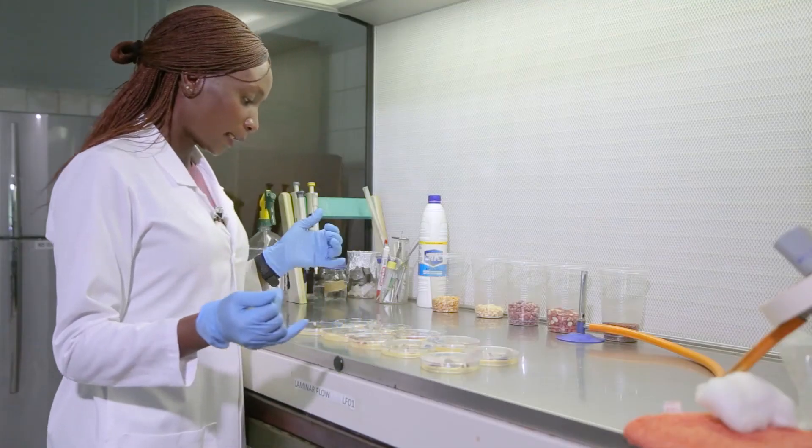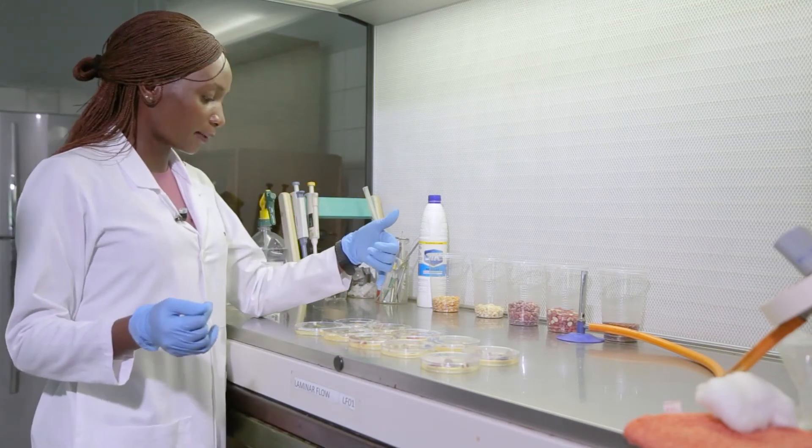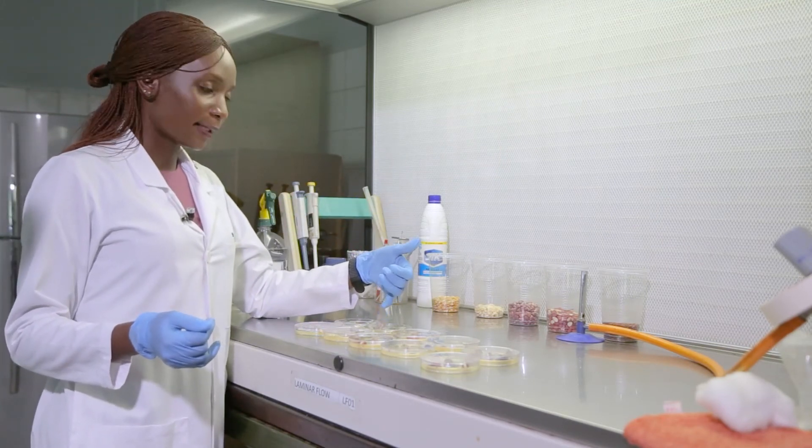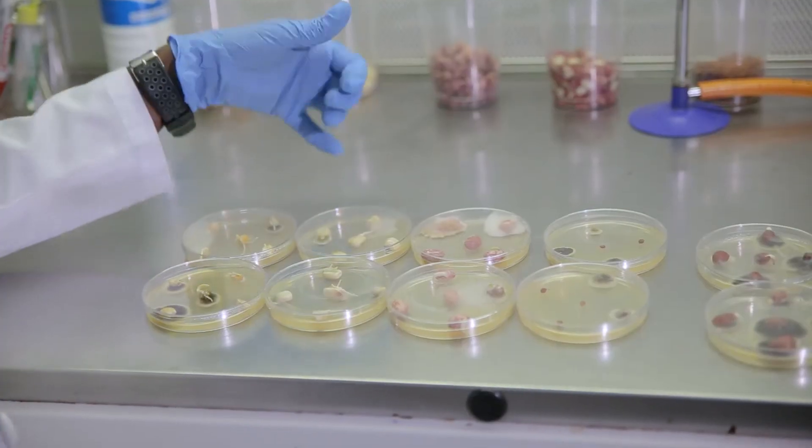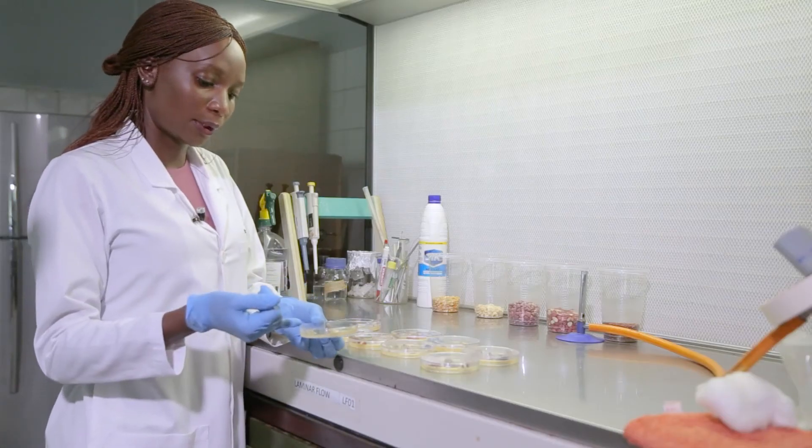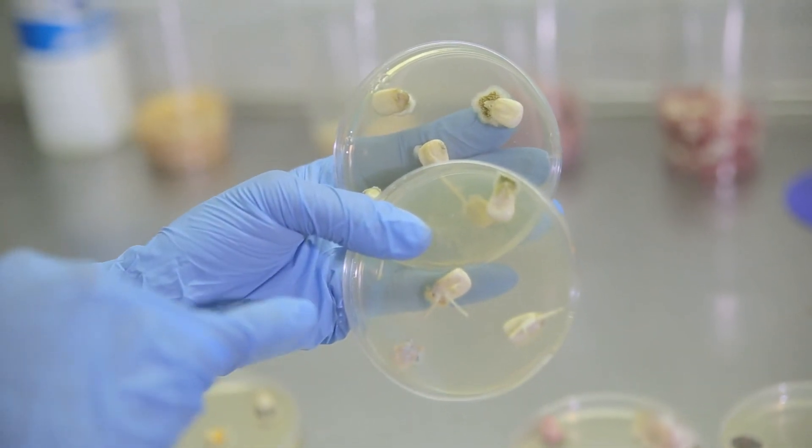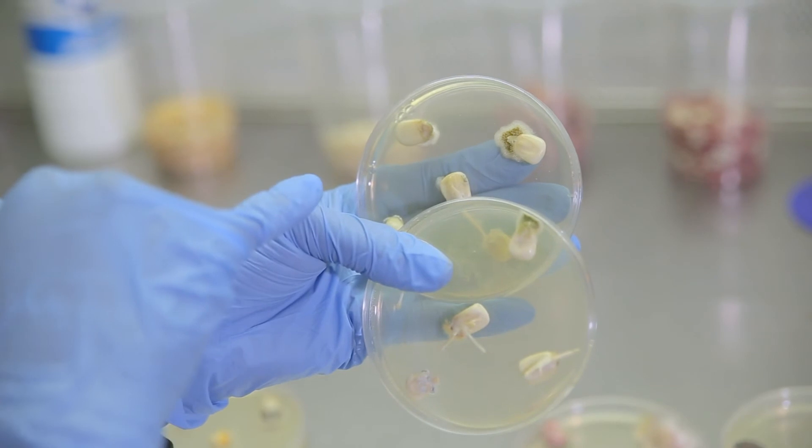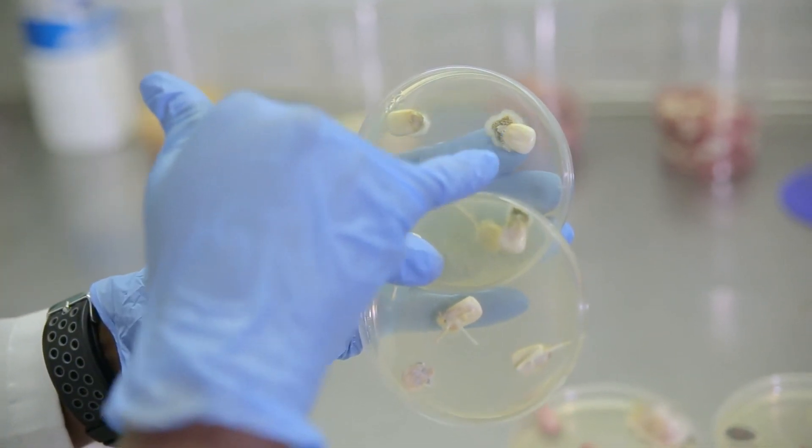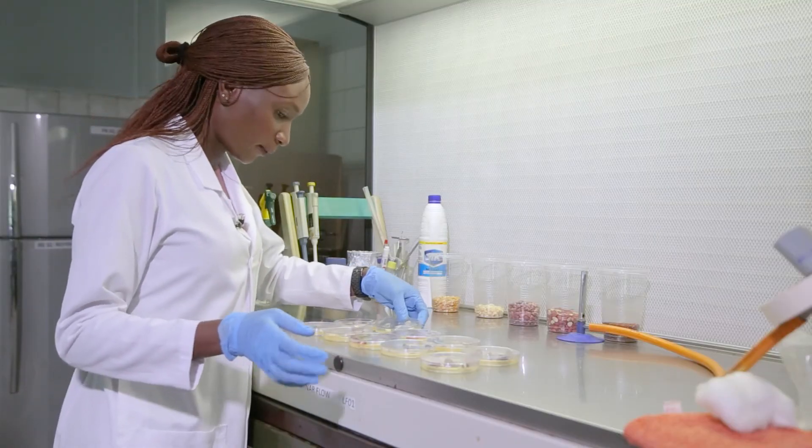The other mold that's very critical, of serious food safety concern, is the Aspergillus flavus. Presumptively, this mold here on this seed and this seed here—it presents itself at times as a light green or a brown coloration. So presumptively, this is Aspergillus flavus. This too is also Aspergillus flavus.